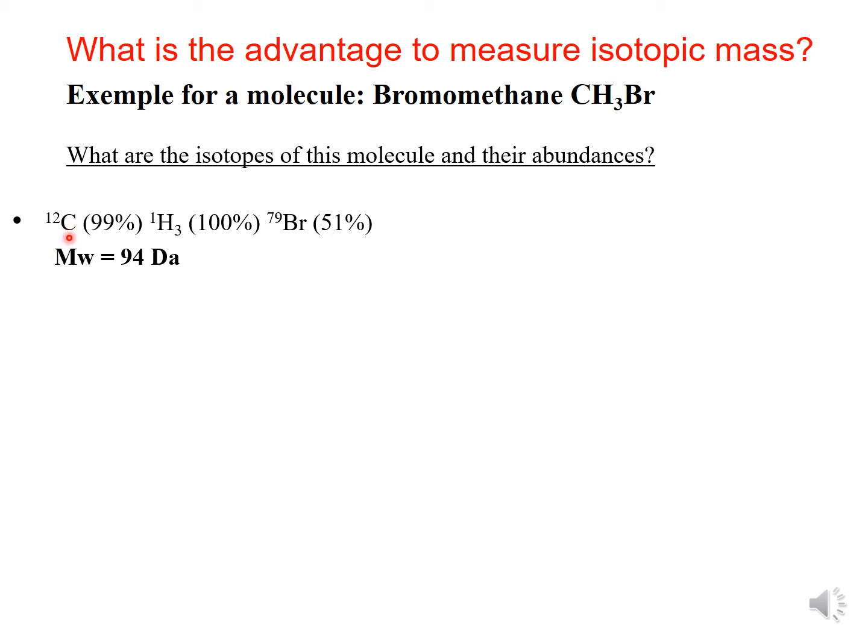It is first a C12 carbon because this is 99% C12 carbon. We have 3 protons; proton is considered as 100% proton 1.